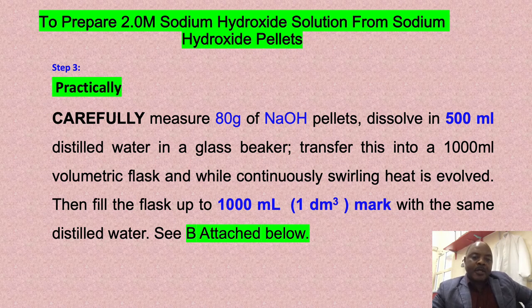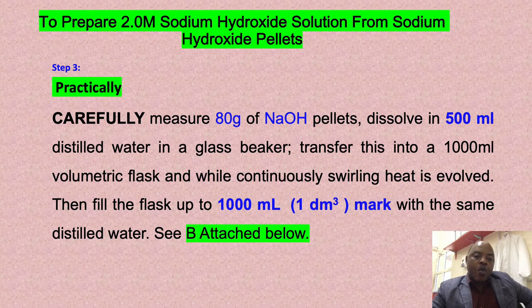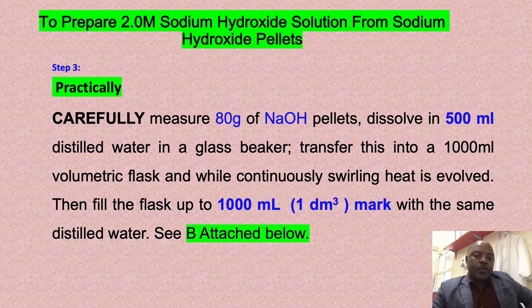Once a uniform solution has been formed, we transfer it from the beaker into a 1000 ml volumetric flask. Using the deionized or distilled water, we fill up to the 1000 ml mark. This gives us the two molar sodium hydroxide solution prepared from sodium hydroxide pellets.